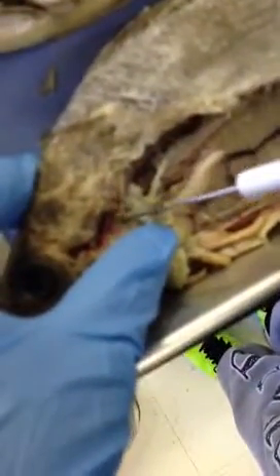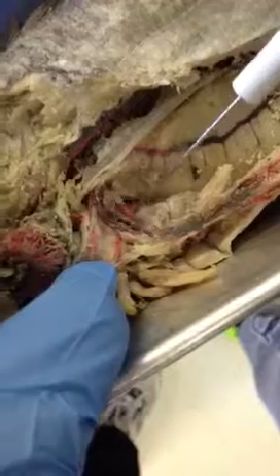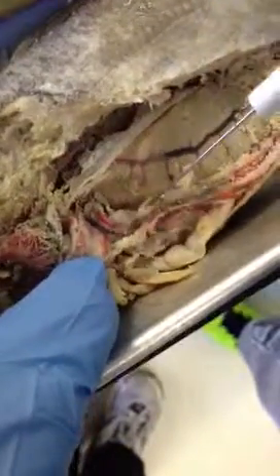So going into the arteries right here, coming off of the dorsal aorta, we have the coeliacomesenteric artery, which is right here. That's going to feed into the intestine. And if you trace it all the way back up, you see it comes off of the dorsal aorta. Right here. And it comes down into the intestines. And then here on the small intestine, all these little arteries are the caudomesenteric arteries.